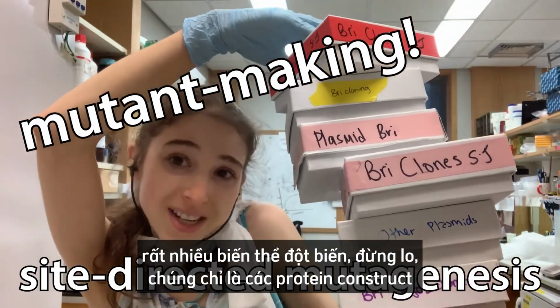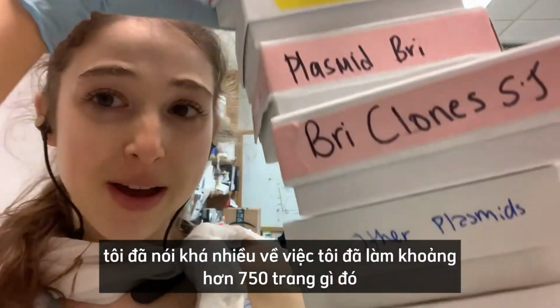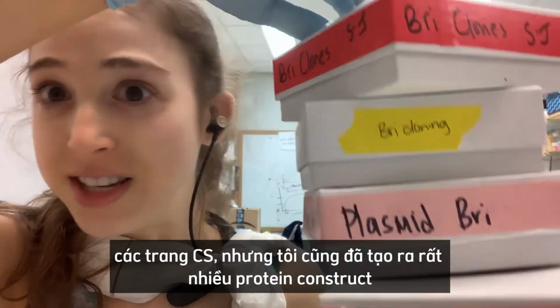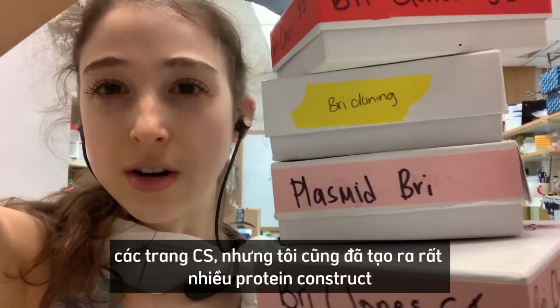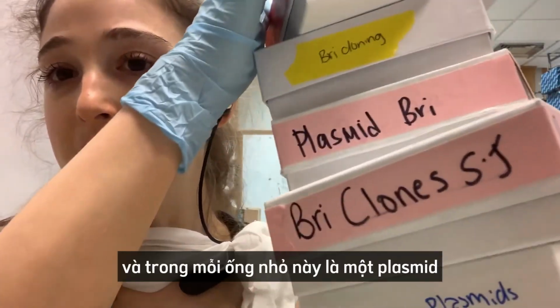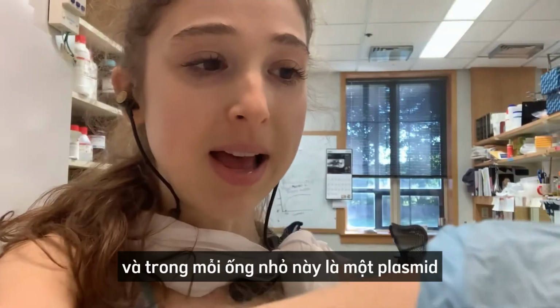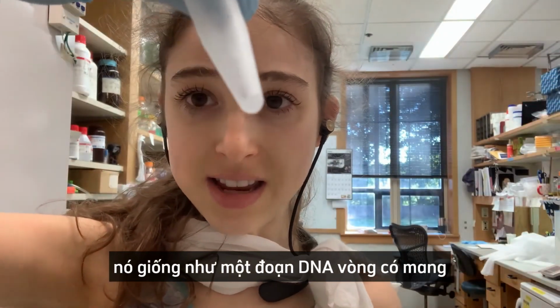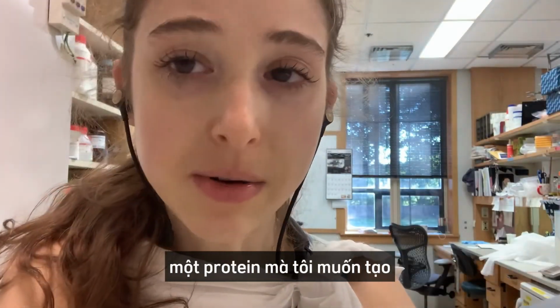Mutants! Many mutants! Don't worry, they're just protein constructs. So I've talked a lot about how I've done 750-something SDS-PAGEs, but I've also made a ton of protein constructs. These are different versions of proteins that I want to make. And in each of these little tubes is a plasmid, a circular piece of DNA that has inserted into it the instructions for making a protein that I want to make.